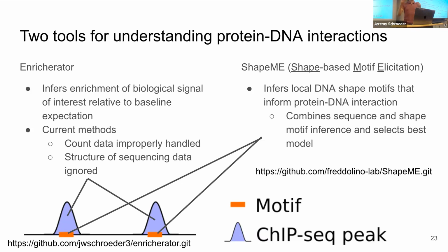Every time I fit this model, I actually look at the posterior samples. We get posterior predictive samples of the sequencing counts to see how well they match the actual data. And Enricherator is just doing a very good job. And so I think, yes, absolutely we are going to lose some informative spikes that actually mean something biologically. But if those spikes are informative and are in your data and are well supported by your data, you have short enough sequencing fragment sizes to actually, your smoothing should just work out to capture it.